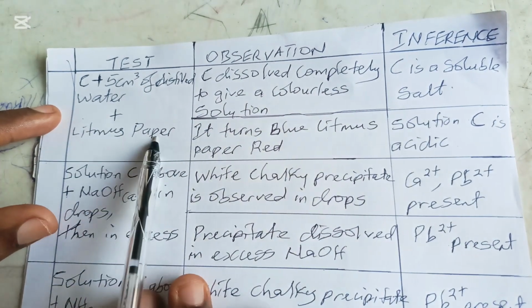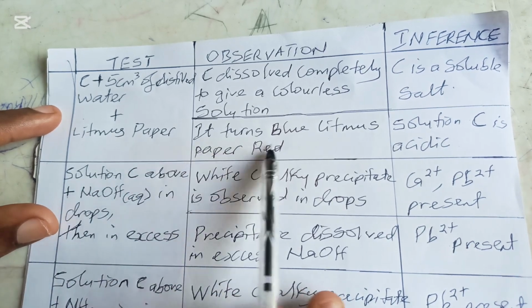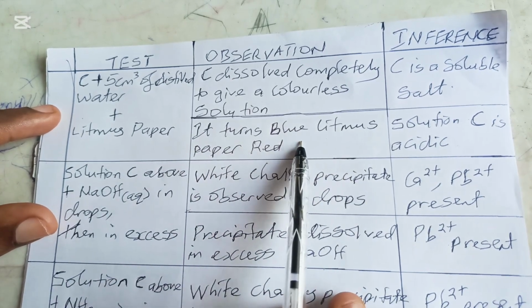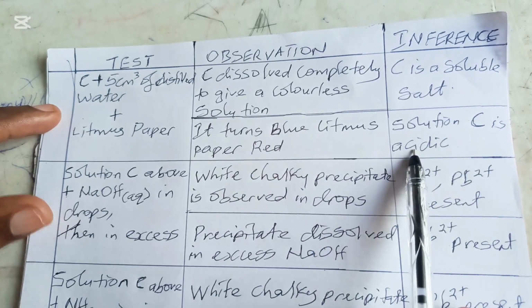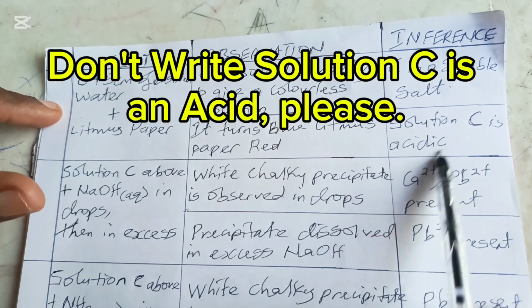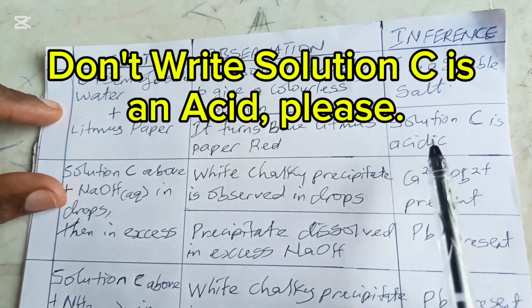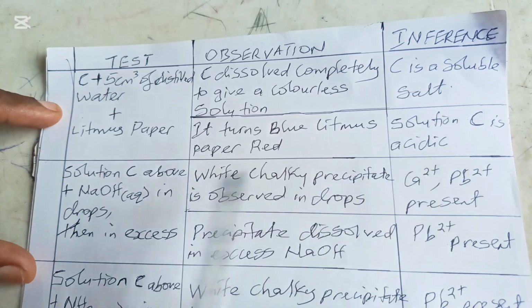Plus litmus paper. If they ask you to put litmus paper, you have to say it turns blue litmus paper red. So that's what is expected of you. So solution C is acidic. Please don't say solution C is an acid. There will be deduction of mark there. Don't say solution C is an acid. Solution C is acidic, please.